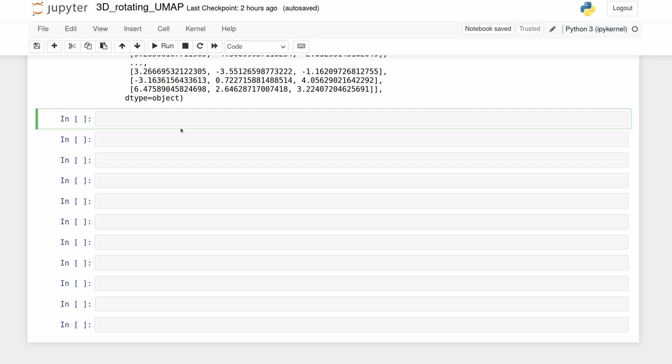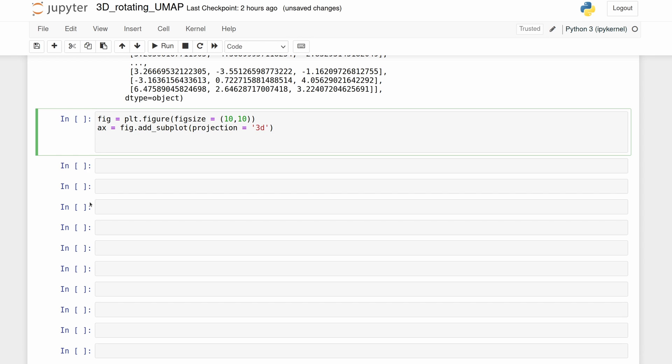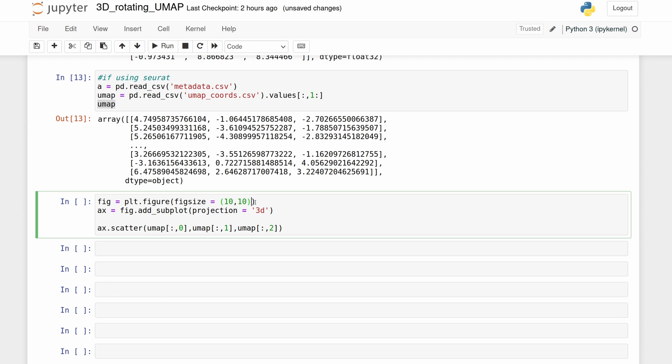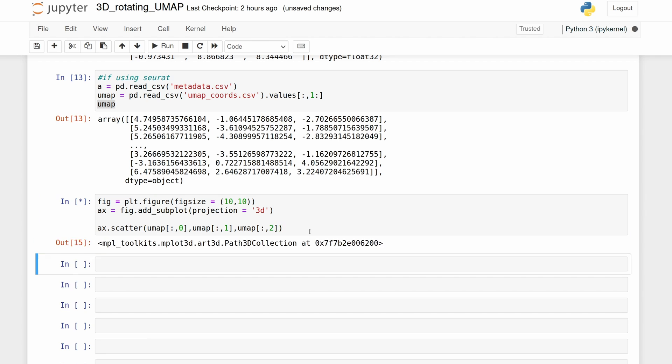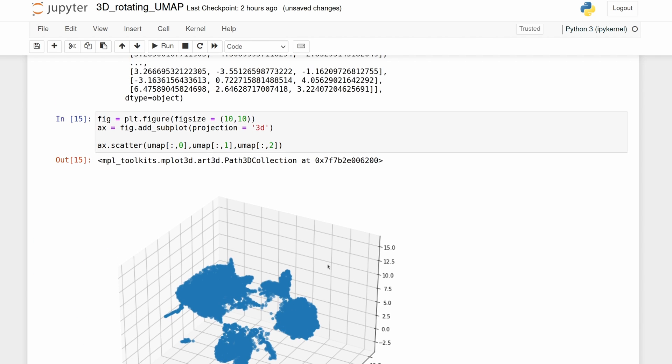Let's go ahead and make the simple 3D plot. So we're just initializing the figure, adding a subplot and saying that it's a 3D projection. And then we're passing the three columns of UMAP x, y, and z to scatter. And you see, we haven't specified color yet, so it's just blue. So let's do that now.